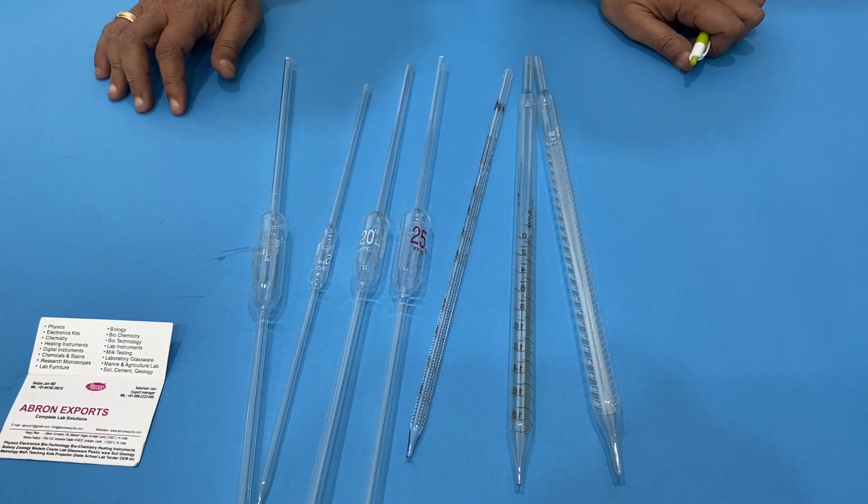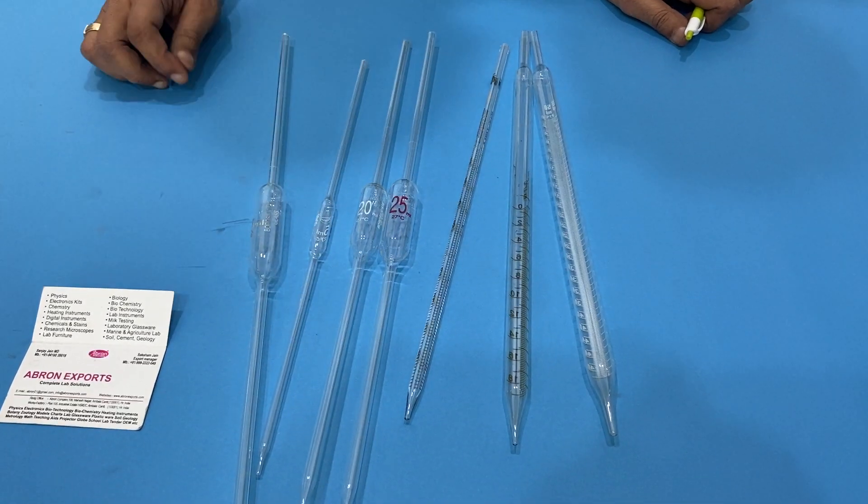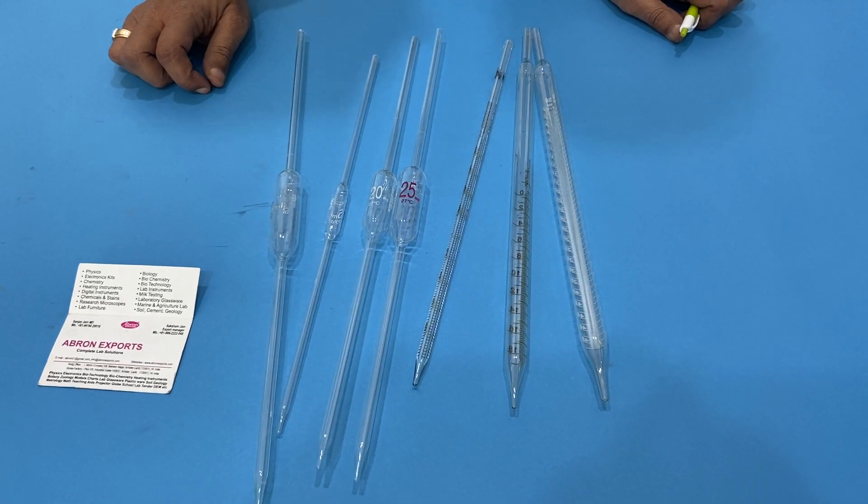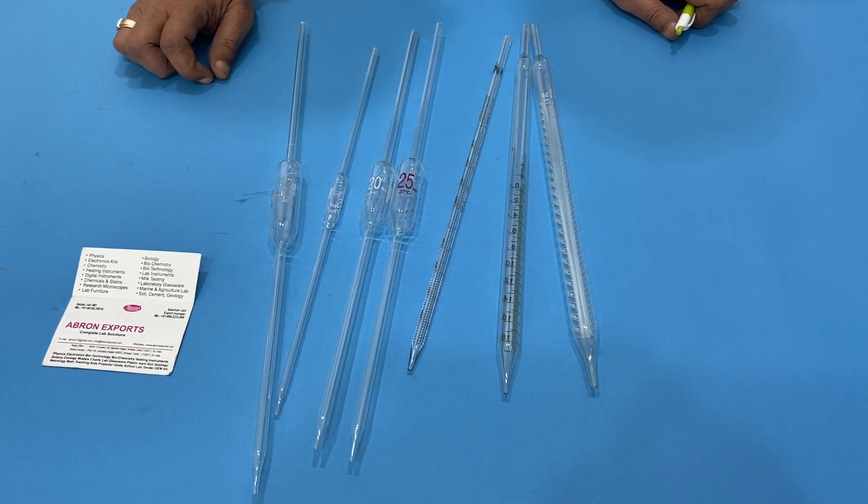There is another pipette where you have to blow out the bulb — you have to specifically note that this is the blow-out-last-drop type. Then the volume will be exactly 25ml.